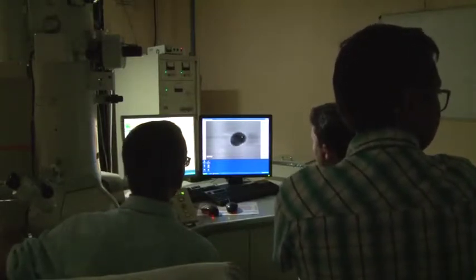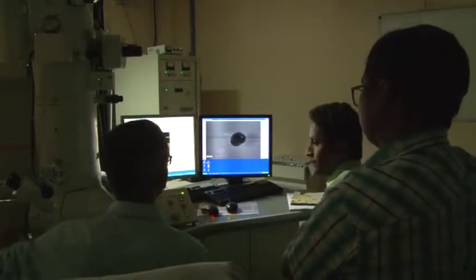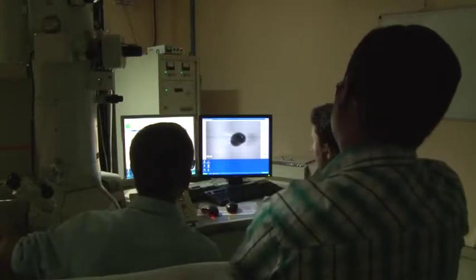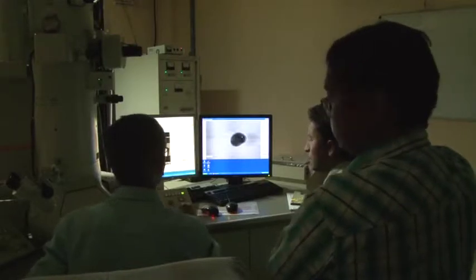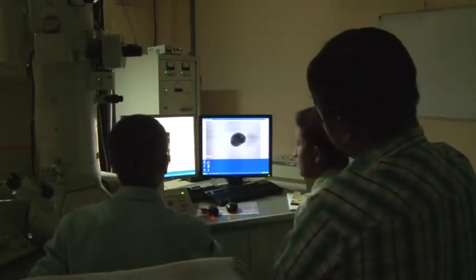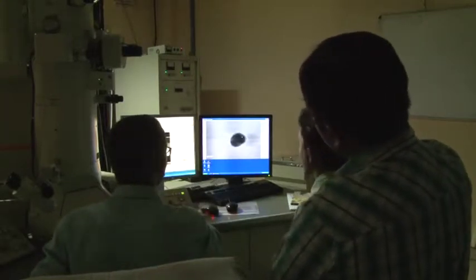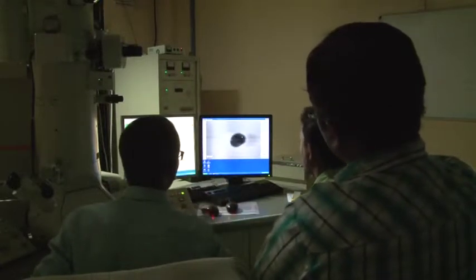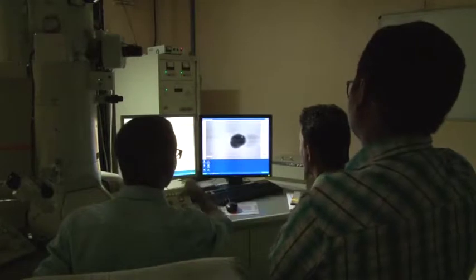Sorry, this is the intensity, the wrong knob. This is the objective knob. We were under focus, that's why the bright fringe, and now as I go to the right the white fringe has gone, and if we go further, a black fringe should appear.